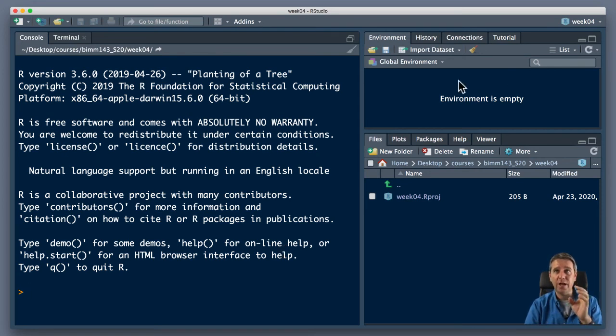See, my environment now is empty. This is all going to be specific for the project. I'm not going to have all those little droppings like my x, or my y, those student names and student grades coming along and confusing the work that I'm going to do on gene analysis, right? It's a fresh place that's all stored here. The R brain is focused right in here, and whenever it produces output and things, it's all going to go into this folder, this location, and that's going to save us a lot of heartache later. So we're using these RStudio projects to keep ourselves organized.